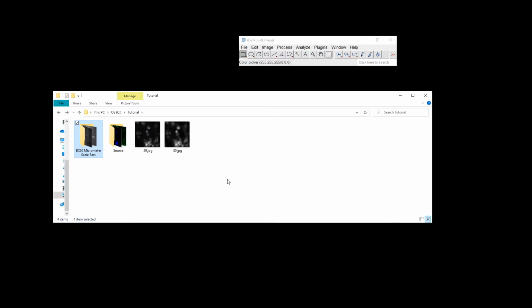And it is okay if your images are in the format of JPEG or TIFF. I noticed some groups with the TIFF files, they are enclosed in these folders, and the TIFF files themselves have this default file name that the acquisition software gave. So I would also organize that, rename them accordingly to your legend, and so those are basically the necessary components for you to merge your images and overlay them.